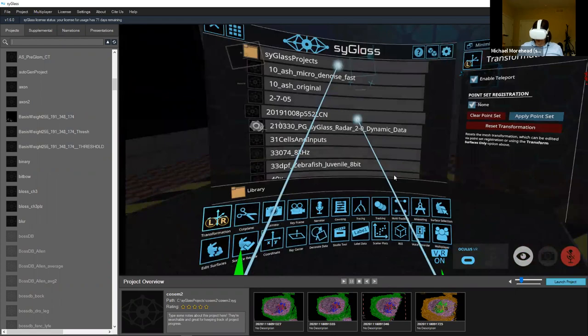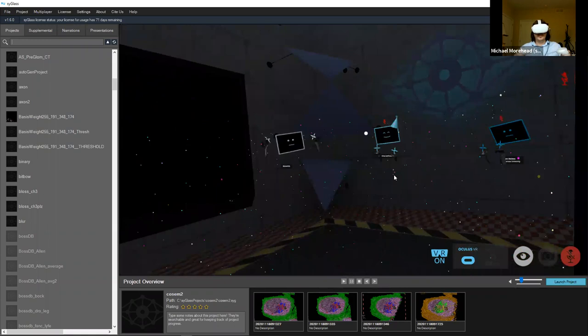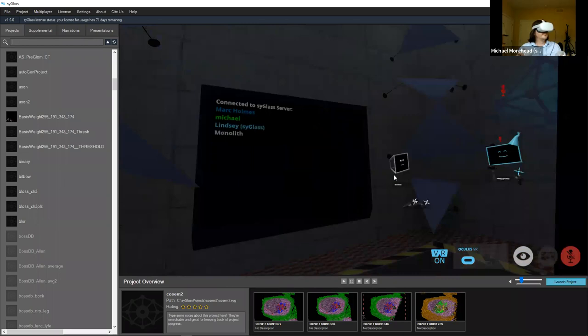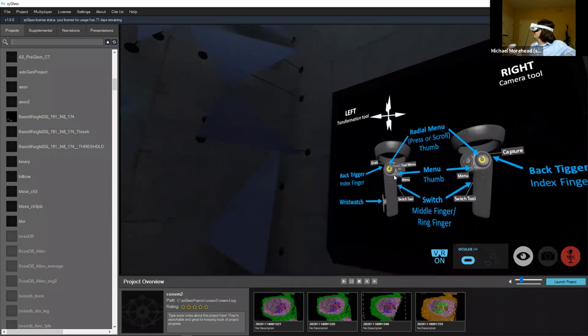If you assign your controller to the multiplayer tool — great, the controls are up, nice job Lindsay. You can also fire confetti from your controllers if you switch to the multiplayer tool.